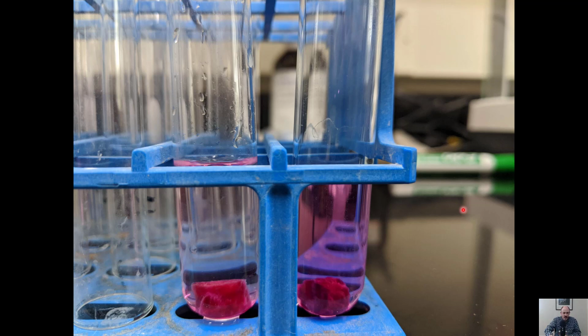So you'll do that for something like, what is it? There's 5 treatments plus the control, each done 3 times. So that's going to be at least 15, about 18 different test tubes you'll be doing, and 18 or so beet fragments you'll be using, if I did the math right in my head. Okay, so that's what you're doing this week.